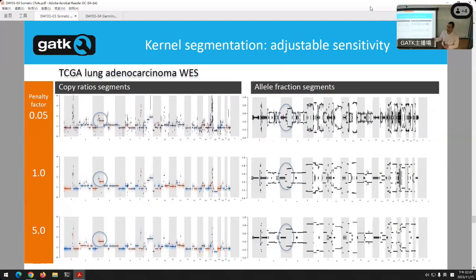Sometimes the parallel way of thinking about this is you're trying to use a projector, and the projector doesn't have the right resolution. So you change the knob a little bit to bring the resolution in and out. The same thing is true here. In the projector, because of how far you are, you don't have great resolution. We do the same thing. We try to adjust the knob a little bit with this penalty factor to get better resolution. And you're seeing that in some of these slides. So the different things you're seeing have different resolutions.